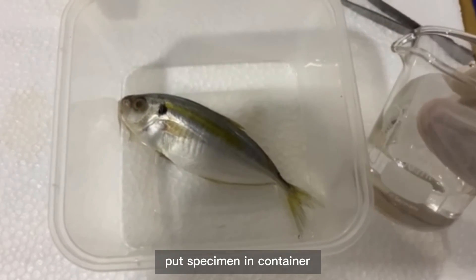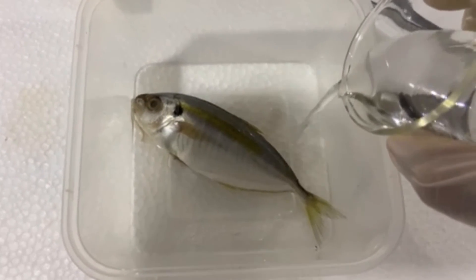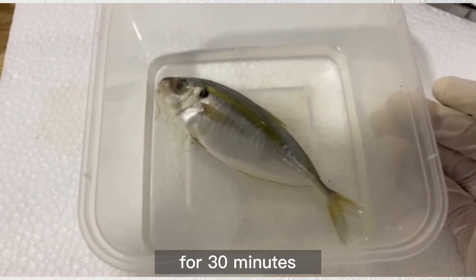Put the specimen in a container and add in 10% formalin. Then let it soak for 30 minutes.